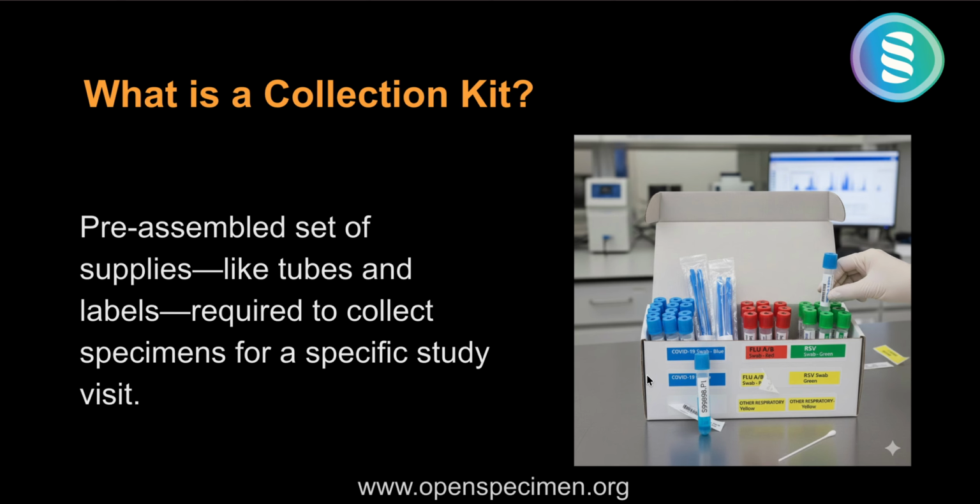Hello everyone, this is Ankita, and in this video, we'll walk you through the introduction of kits in OpenSpecimen. If you have worked with multi-site clinical study, you will know the difficulties and logistical challenges that come with it.